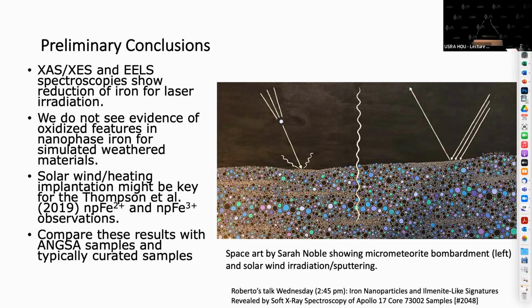Hey, Jeff, this is Kate. So 2 things for the TEM work. Was that a FIB section? Yes, that was a FIB section. And they did also before and after just of the substrate. That was the weathered and unweathered. Those were uniform materials. Correct, yeah. The weathered part was from the rim, and the unweathered from the host or more internal.